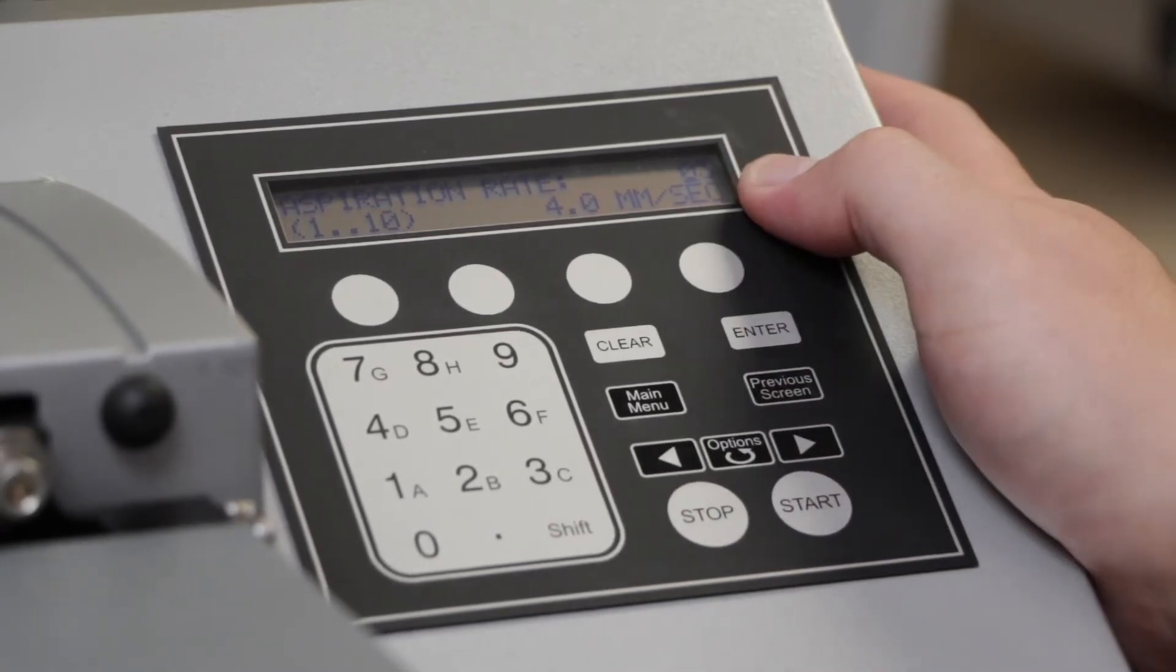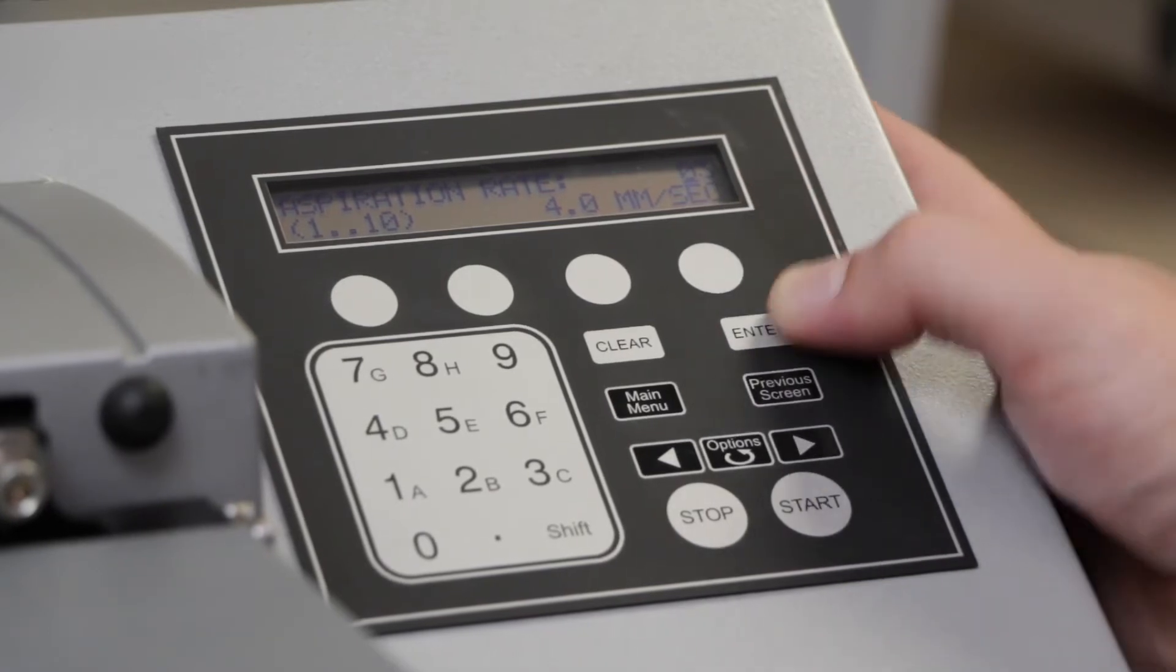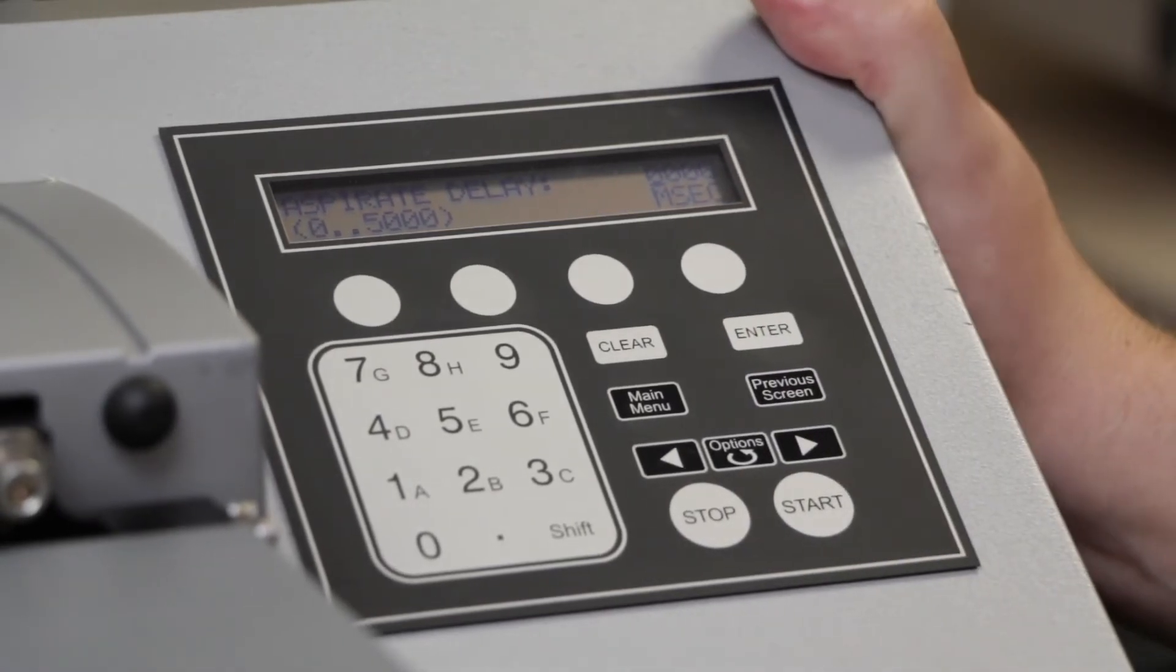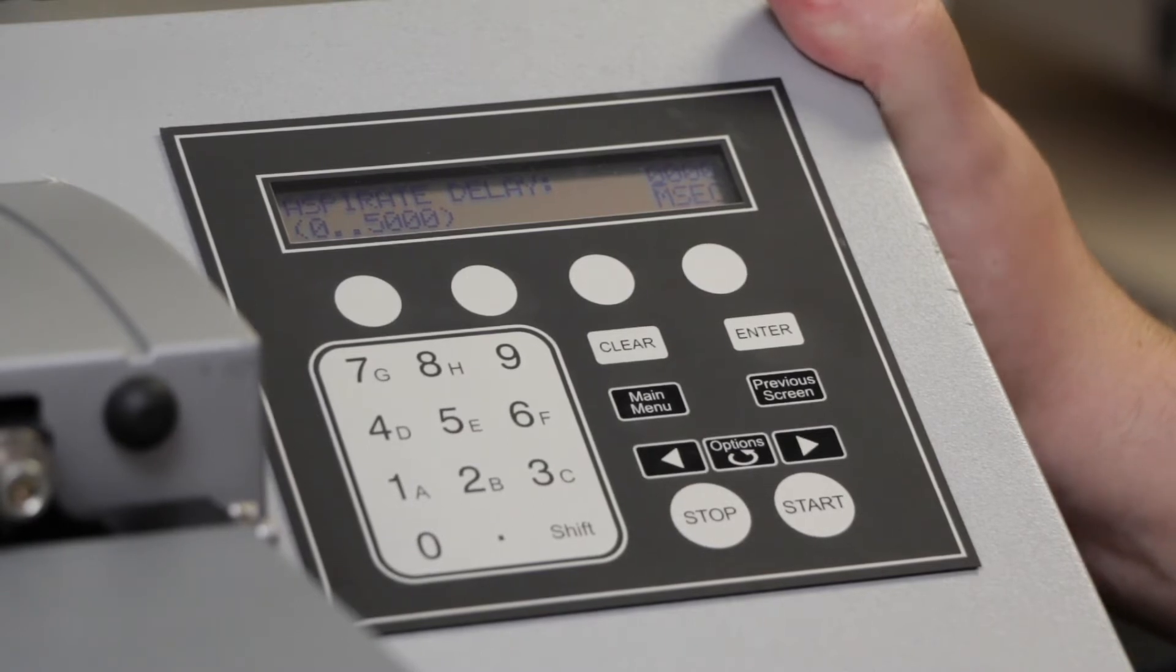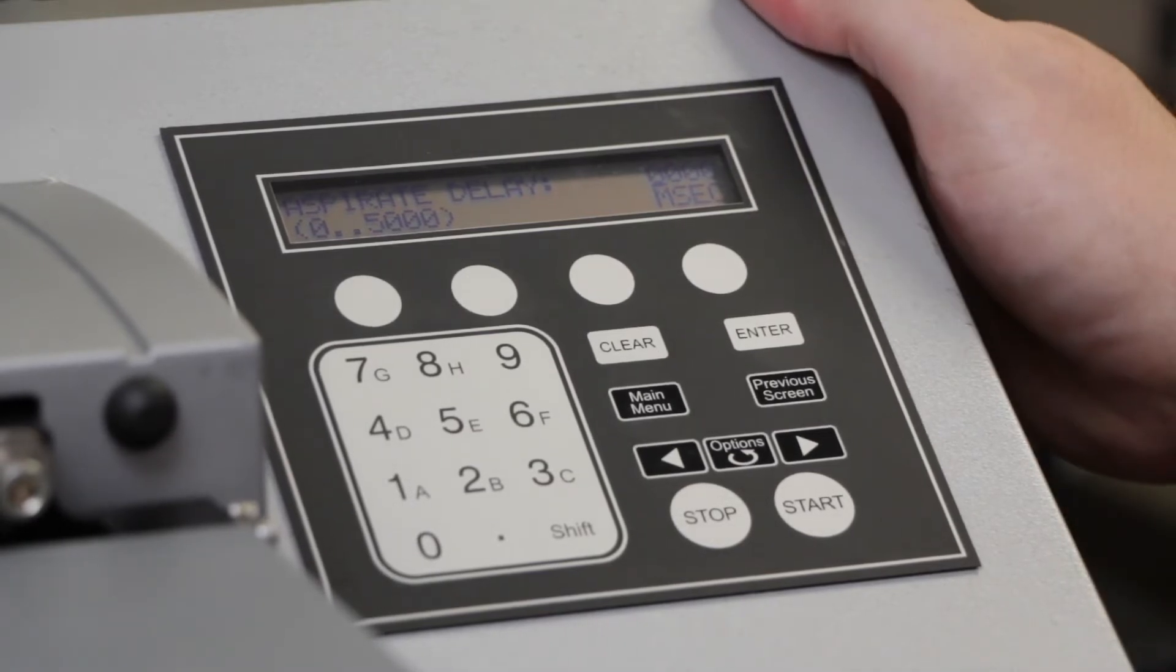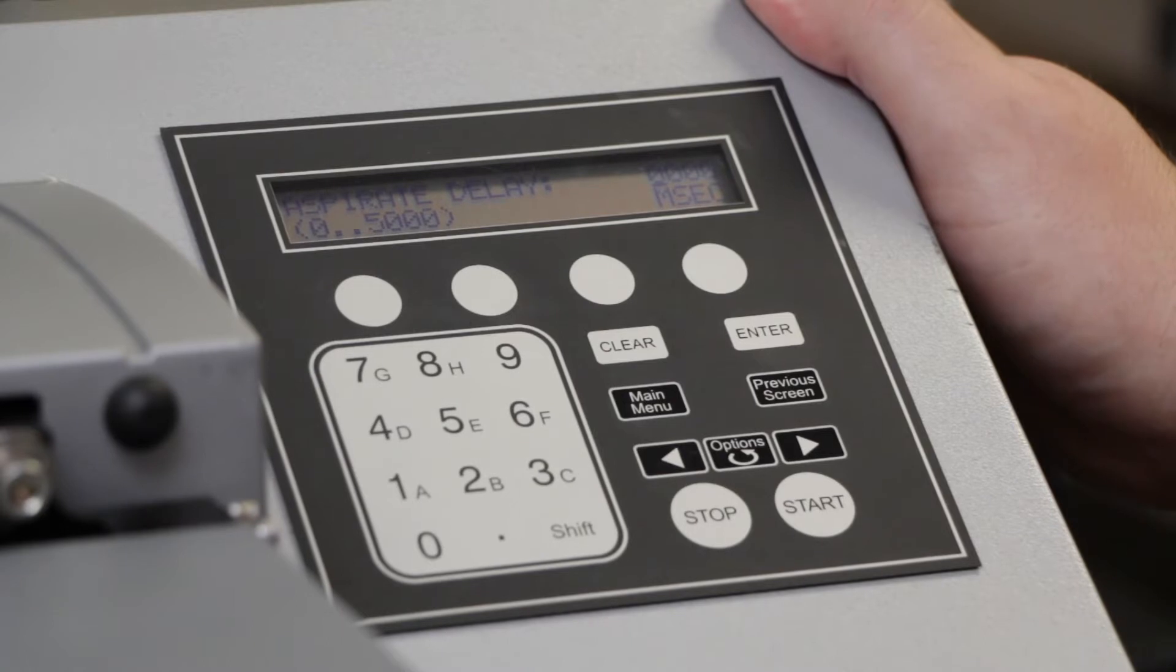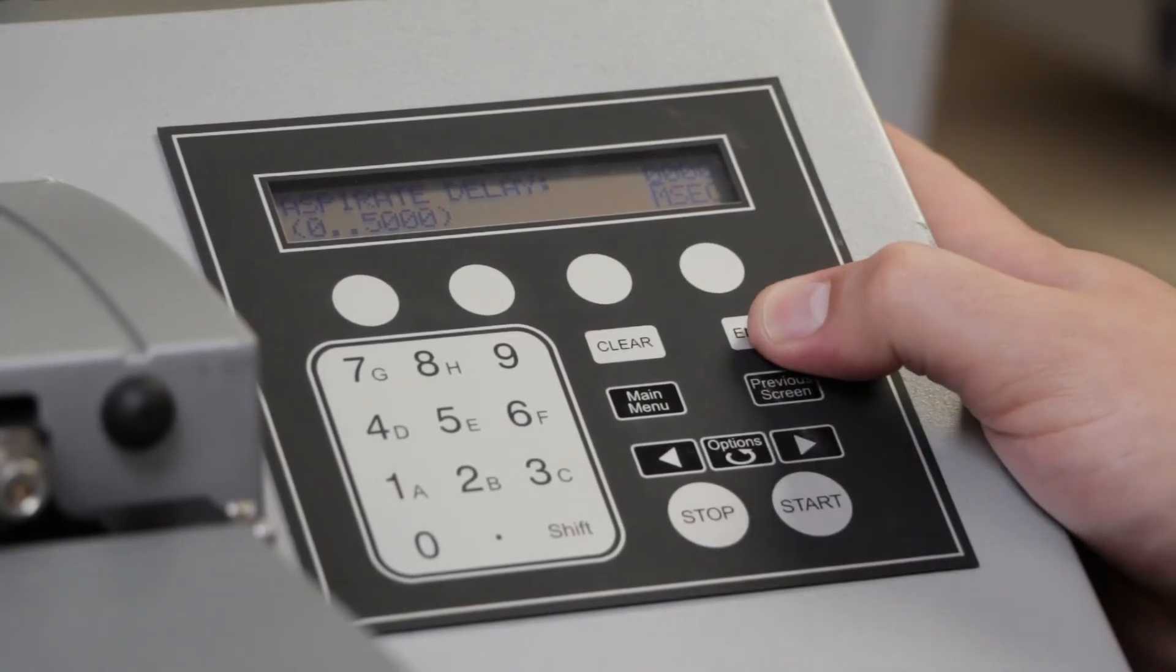These options range from 1 to 10. Aspirate delay is useful if you want to build up a good vacuum pressure prior to or allow a pseudo-soak before aspirating. We won't use that in our protocol.